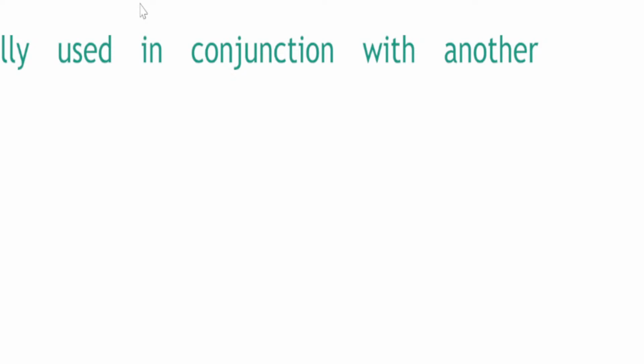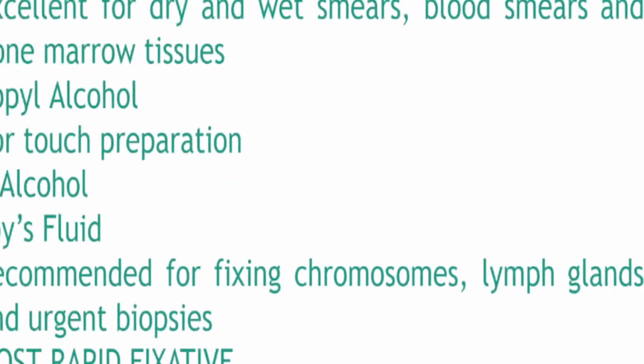It's like when you do laundry, right? We pre-soak. Right, class? Like that. So let's think about it like that. We're pre-soaking the tissue so that the secondary fixative penetrates faster, and the efficacy exponentially increases. Okay. Next, other than that, it solidifies at room temperature, normally at around 17 degrees Celsius.